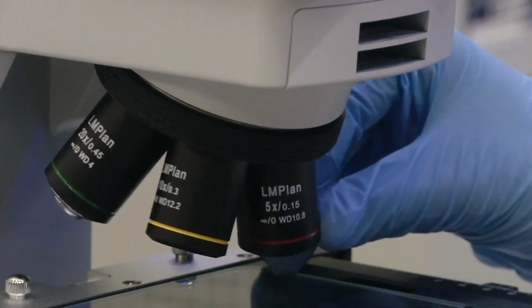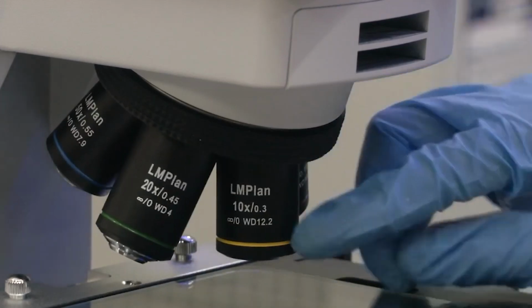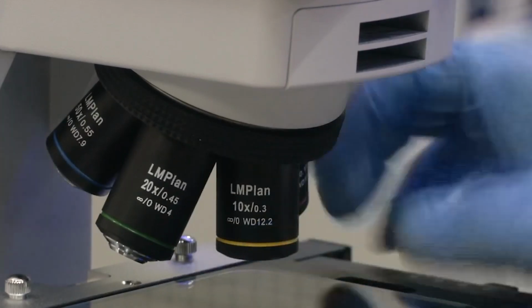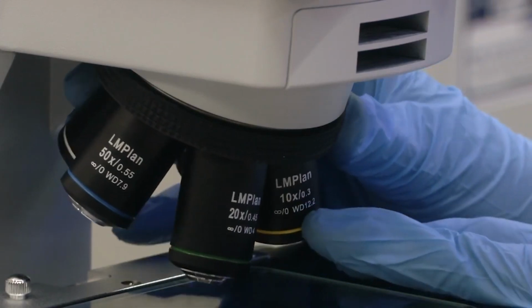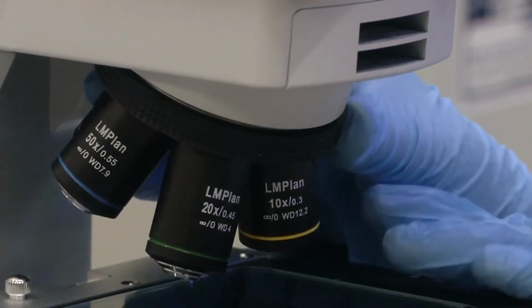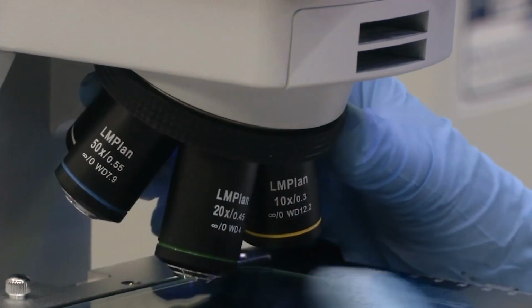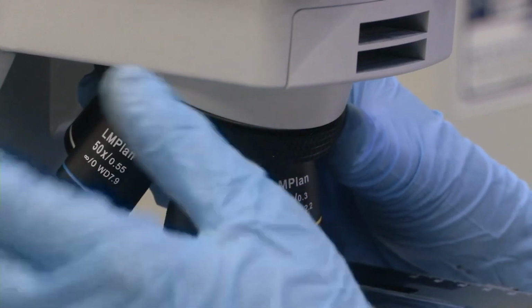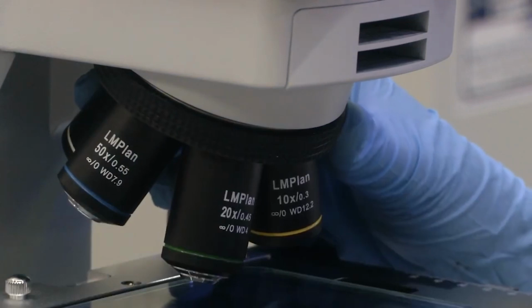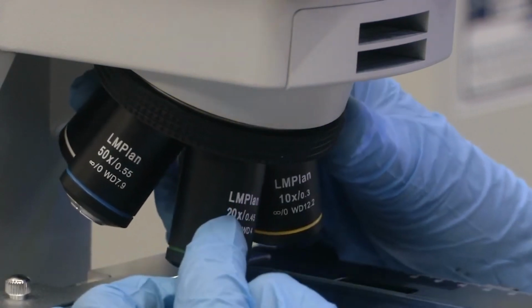As we had seen, the 5x has red color. The next objective is 10x magnification. I think you can see that also written 10x WD 12.2. That 10x objective is yellow in color. Next one we have is 20x magnification. You can see the next objective coming into position. It will keep coming into position because this is where you keep your sample. So this is 20x magnification.